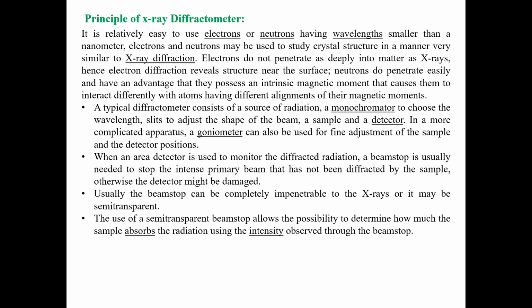X-ray diffractometer मध्ये ह्या वेगवेगळ्या अरेंजमेंट आपल्याला करता येतात. For how the diffractometer is made, with the help of this arrangement, वेगवेगळ्या अरेंजमेंटनी हा आपण तयार करू शकतोय, and from that we are able to find out what kind of informations we got.